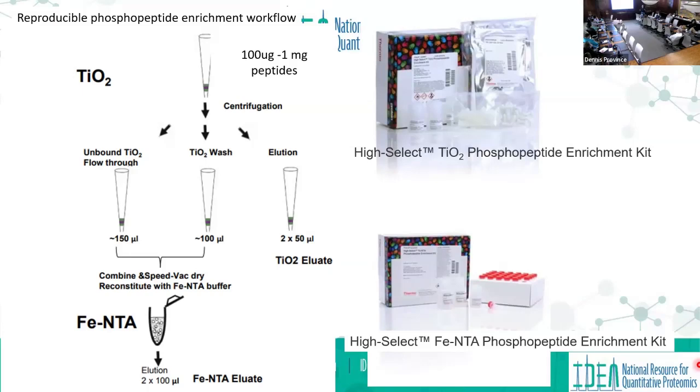Thinking, why would you do that? Well, you're separating these two, and now you're mixing them back in the tube. I thought you were an analytical chemist. Well, it doesn't make sense. Well, they're not really completely selective. You can have some phosphopeptides that will bind preferentially to one than another. It's kind of a capacity issue.